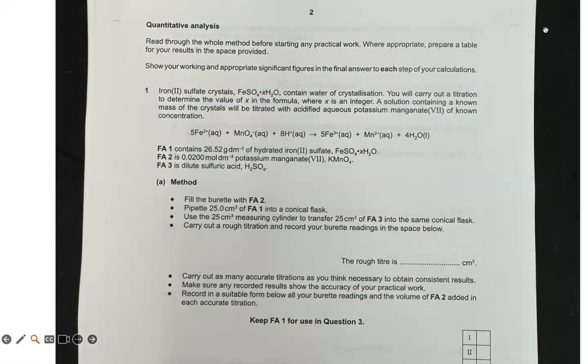And then the materials are given. So here it says FA1 contains 26.52 grams per decimeter cubed of hydrated iron(II) sulfate. FA2 is 0.02 molar potassium manganate(VII). And FA3 is dilute sulfuric acid. The methods are as follows.